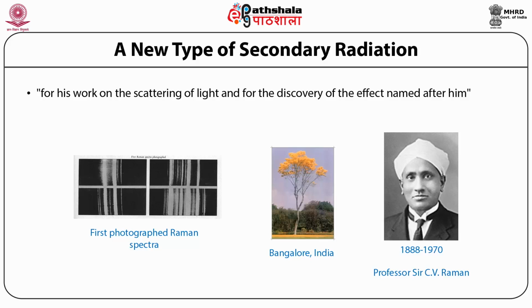This was because of the inaccessibility of serious monochromatic light sources and the absence of reasonable optical parts and detectors. After the discovery of lasers in 1960 and the advancement of high-throughput monochromators and sensitive detectors, Raman spectroscopy has been progressively applied to solve problems of both technological as well as fundamental interest.